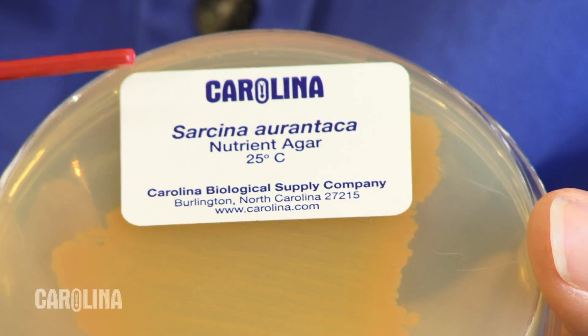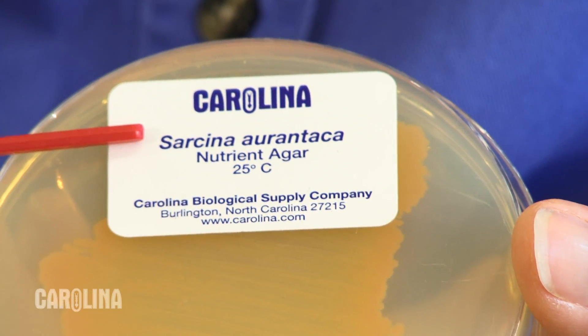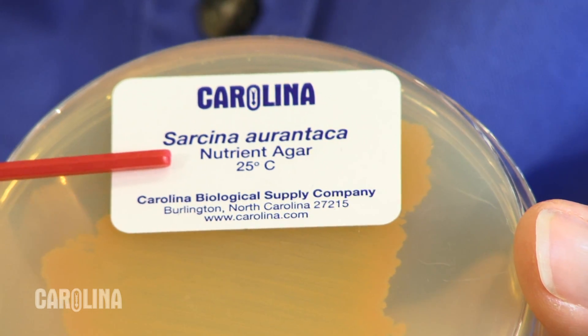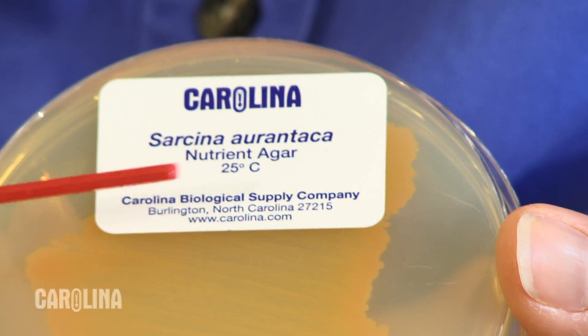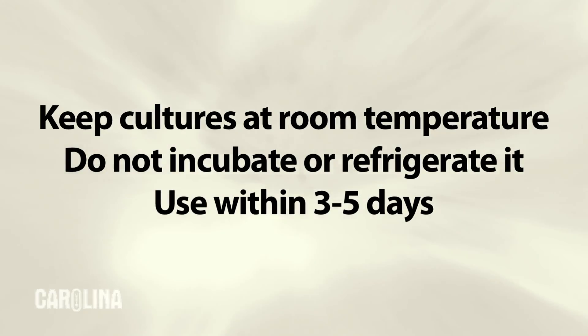Every culture is labeled with important information: the type of bacteria, the type of agar, and the optimal temperature at which the culture was incubated. The live bacteria culture is ready to use upon receipt. Keep it at room temperature and do not incubate or refrigerate it. For best results, use within three to five days.